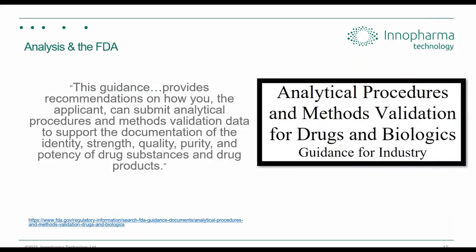All right, moving a little bit on then, just from, let's say, the types of particle size analysis that are out there, the orthogonal methods, and a little bit on from the ways you can actually measure particles. If we actually talk a little bit about guidance documents from the FDA, so we have the analytical procedures and method validation. This might be familiar to some of you, but it's a great document if you haven't seen it. It basically shows a path of how you can take maybe an existing method compared to an orthogonal method to build a case really for bringing that method into your factory. So why would you do something like this? Why would you do this analysis?